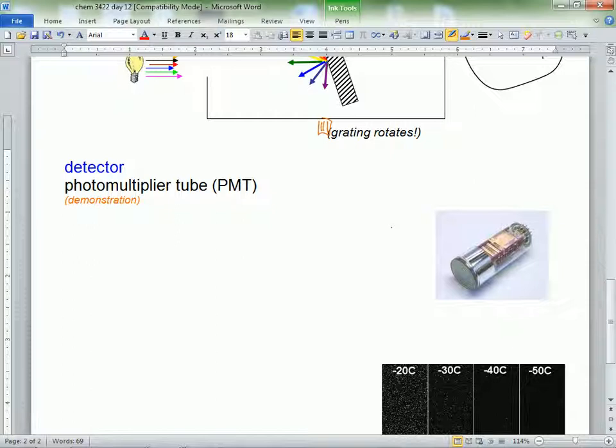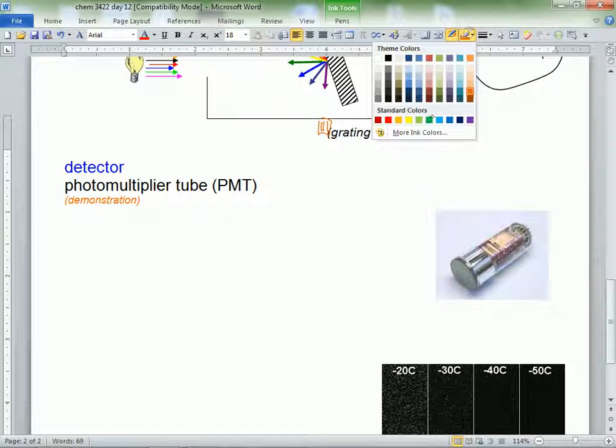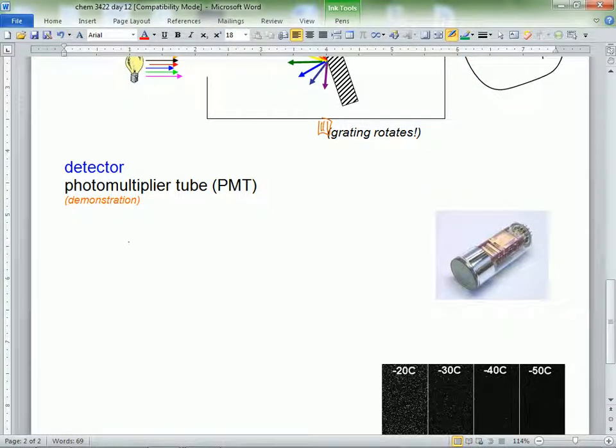That's what I want you to be able to draw here: sketch what a PMT is. Pretty much how I like to do it is, first you have some hunk of photoemissive material. In this case, it's copper. No, it has to be a metal that, because copper doesn't kick out electrons, it's going to take a lot of energy.